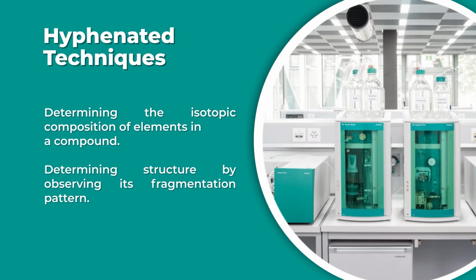How do we determine the structure? First, fragmentation will give us the mass. Those fragments we can further fragment. We can have MS, like GC-MS, LC-MS. When I say first mass, that means I do the fragment's mass to charge ratio, and for each fragment it is possible to fragment it further.